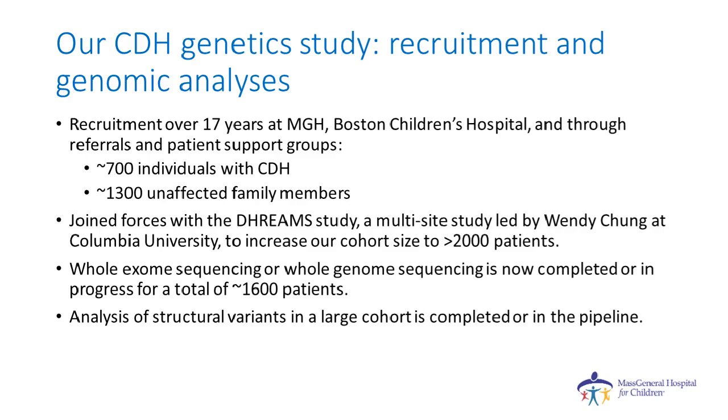Recently, we have also joined forces with the DREAM study. This is a multi-site study led by Wendy Chung at Columbia University. And by combining the two cohorts, we've increased our size to approximately 2,000 patients. We have been studying these patients both for sequence variation and structural variants. About 1,600 patients have undergone whole exome sequencing or whole genome sequencing to study sequence variants. And we are in the process also of analyzing structural variants in a large cohort. And that's really going to be the focus of today's talk.